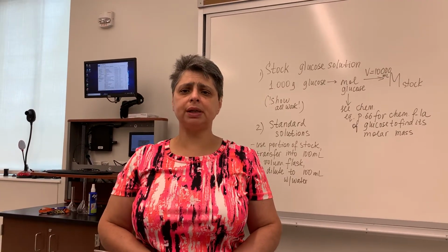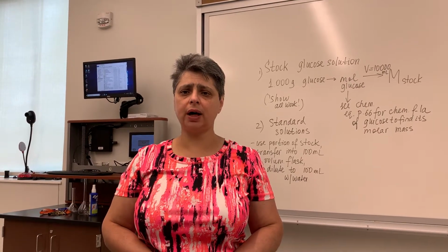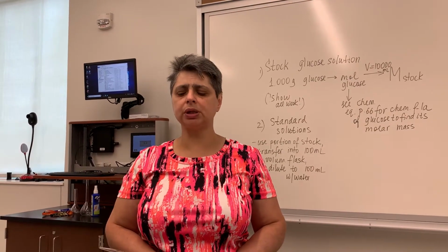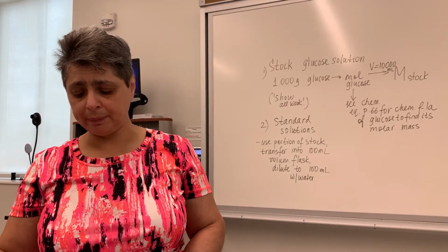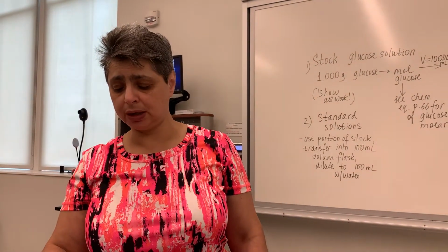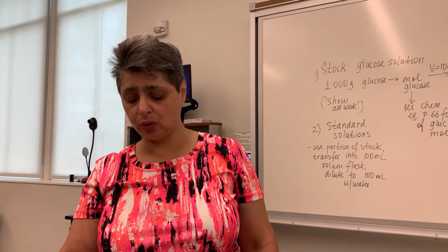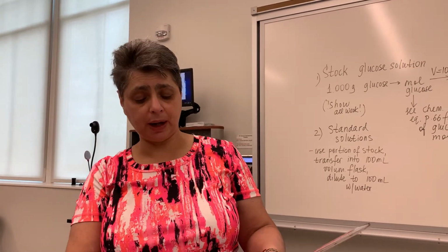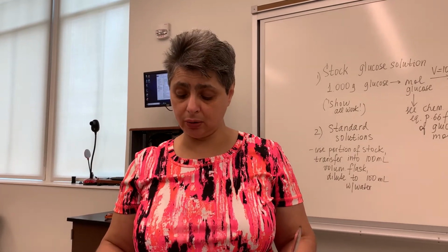In this pre-lab, besides the pre-lab itself, you will also have to upload an Excel file containing a calibration graph of absorbance versus concentration of glucose. So we're looking at question 3 on page 65, that's your pre-lab. In question 3, it talks about determination of glucose concentration in blood serum based on formation of a blue-green complex of glucose and a substance called orthotoluidine. It says this reaction is shown at the bottom of the page. It's actually on the back of the page, the very last thing on page 66, the chemical equation.